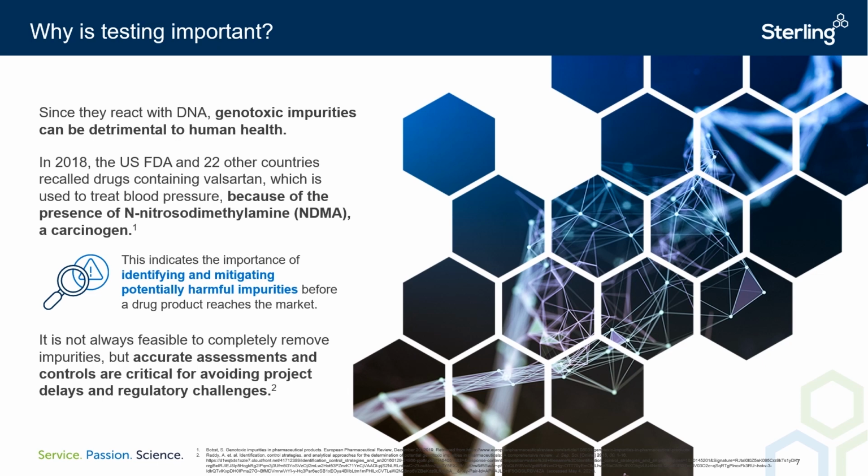There have been occasions where genotoxic impurities have been identified in drug products after they've already reached the market. One example was in 2018 when the FDA and EMA recalled drug products that contained valsartan, which is commonly used to treat high blood pressure. In this instance, N-nitrosodimethylamine, NDMA, a carcinogen, was identified in drug products that were already being sold.